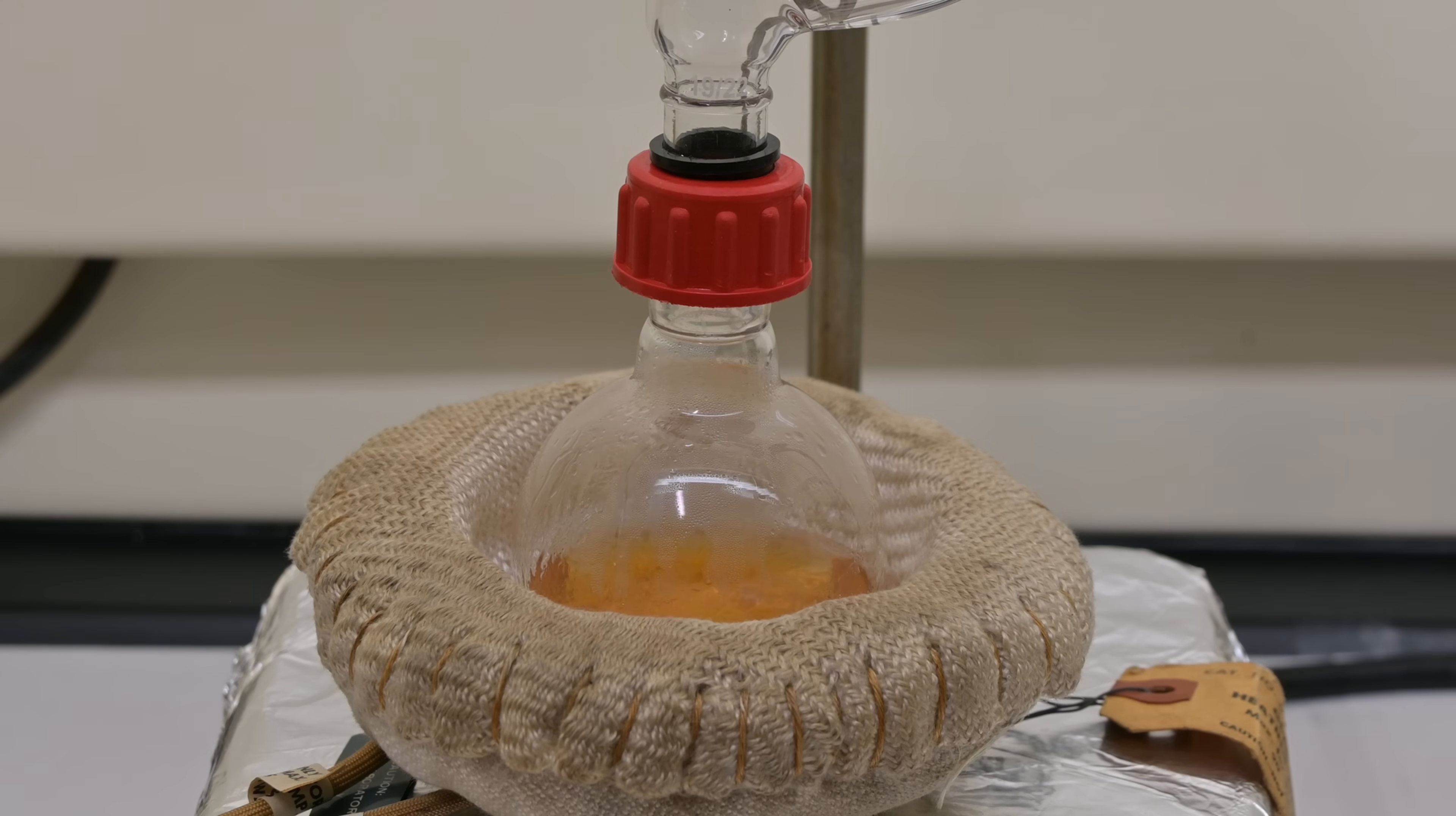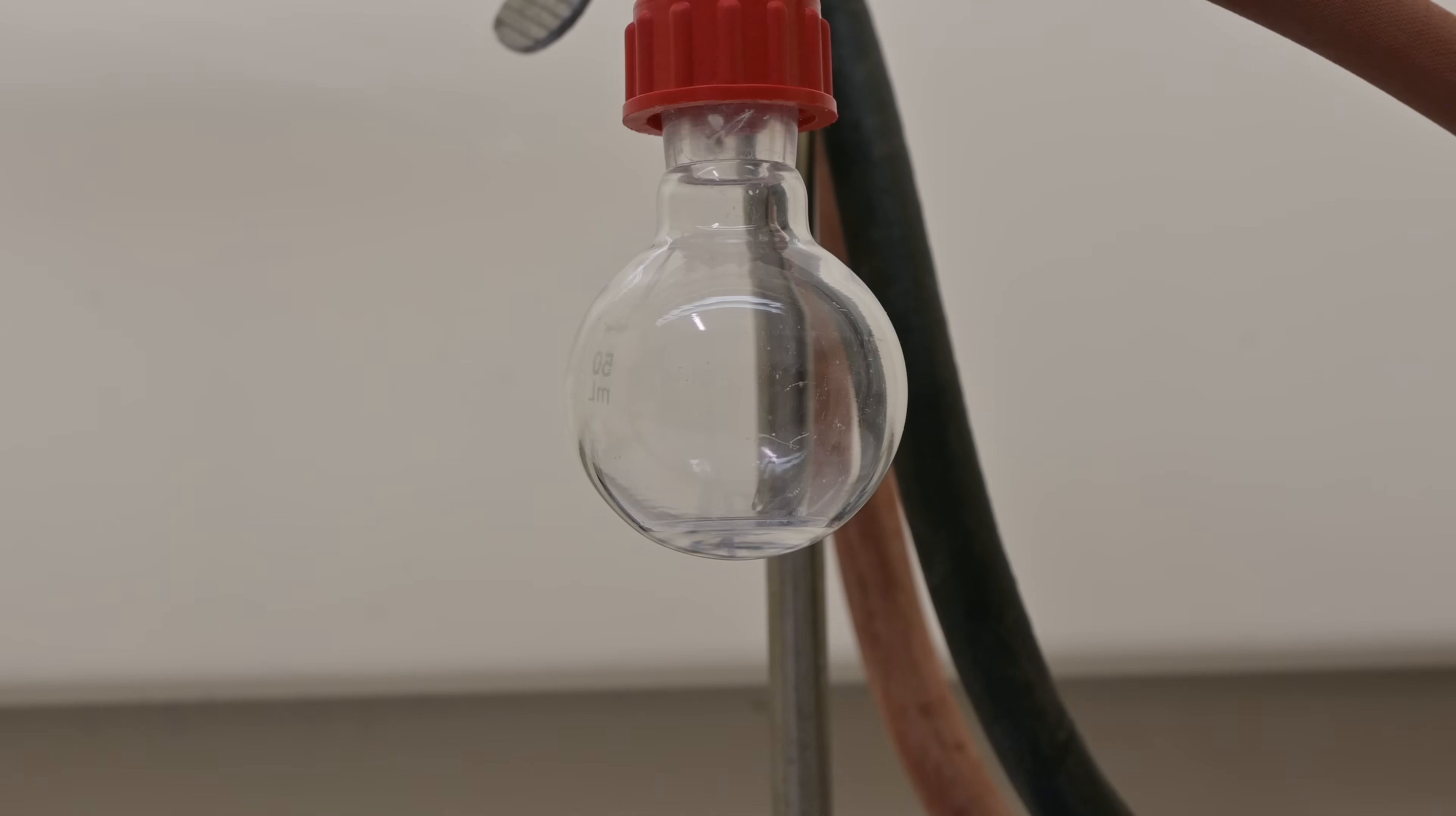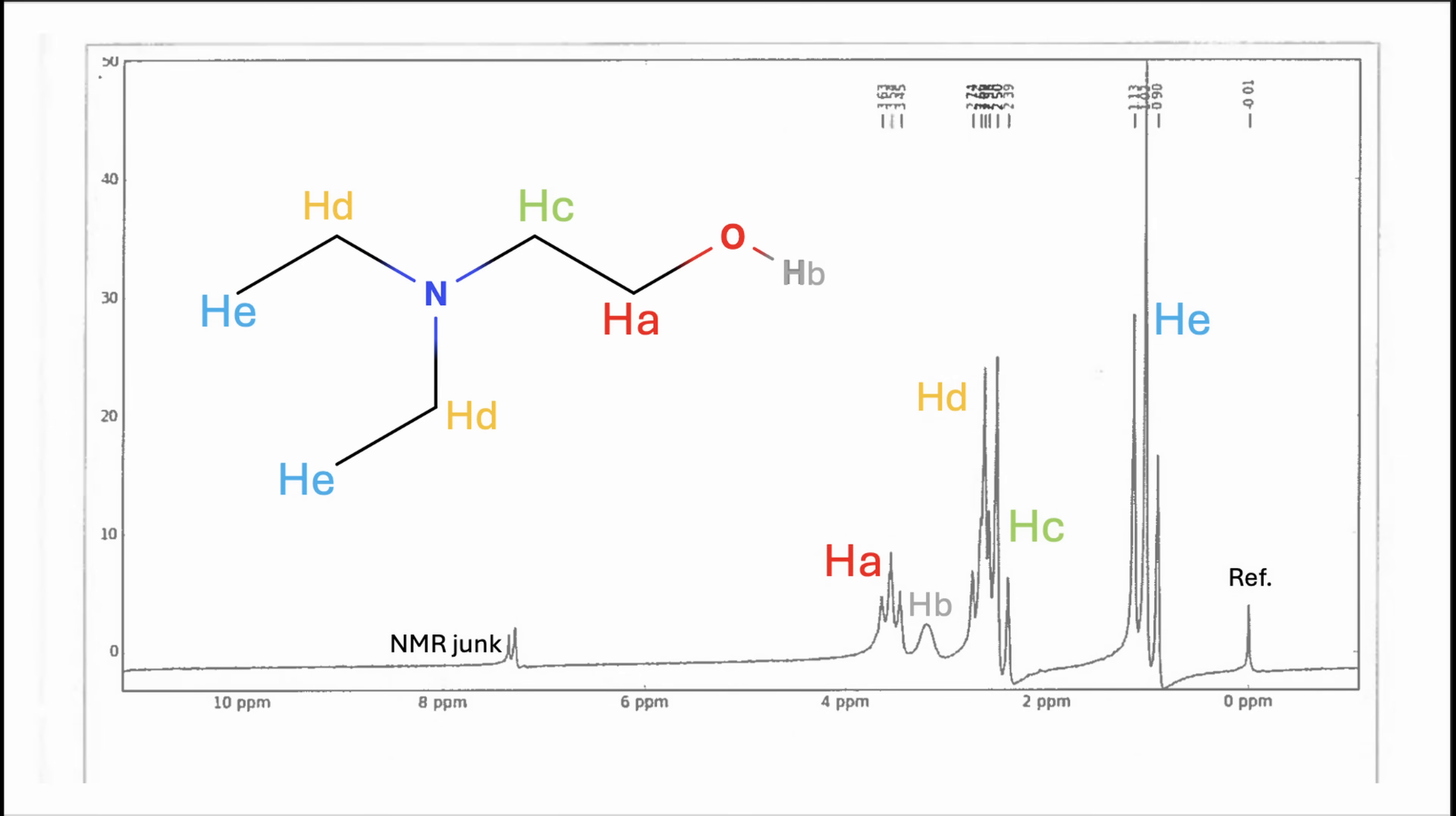At first a low boiling point material comes over, and then once the temperature began to rise, I switched out the flask and began collecting our product. This continued for some time until distillation stopped. At this point, I allowed the distillation apparatus to cool and shut off the vacuum pump. After all is said and done, I isolated about 24.6 grams of purified diethylamino ethyl alcohol, which was confirmed via NMR.